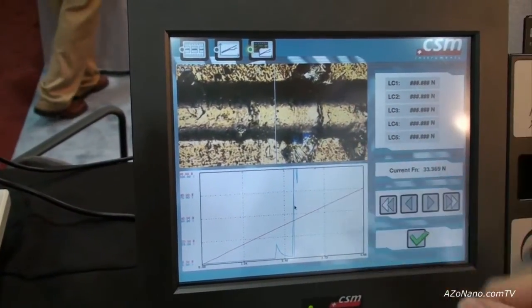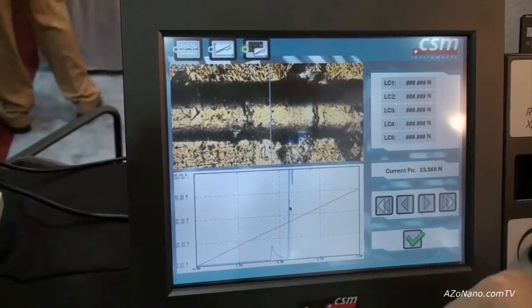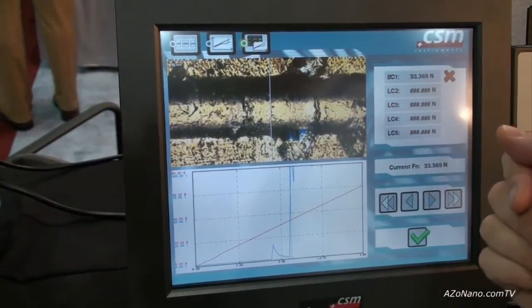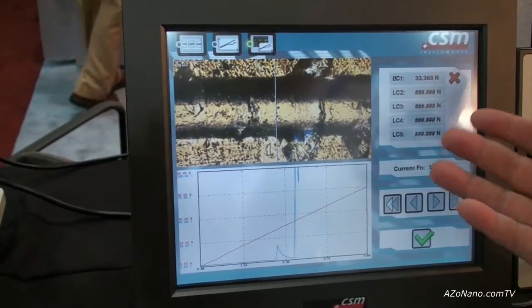So this is basically the data and then once we've selected our zone we click on LC1, that's critical load 1, and we can say this coating fails at 33.36 newtons for example.